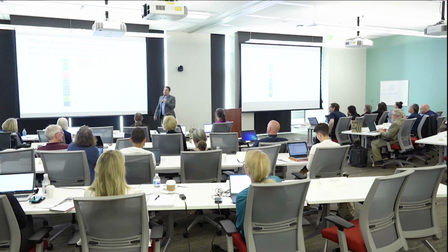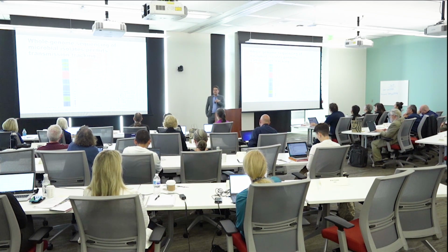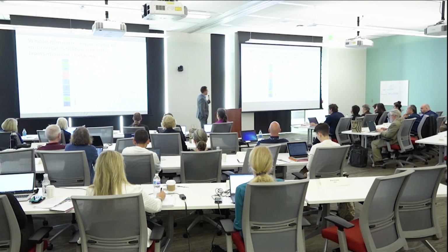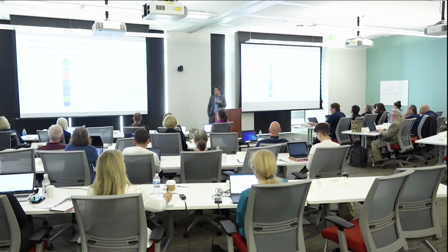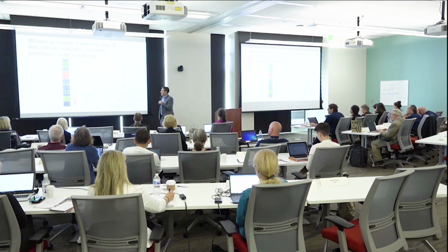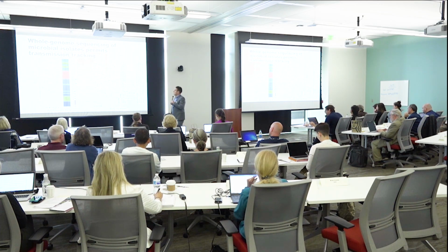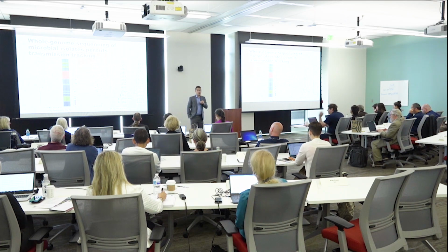Okay, so serious stuff now, slightly more serious stuff. I want to try and sell to you, I guess what I'm selling today is the idea of source attribution and epidemiology and strain tracking. And I'm going to give you two hopefully quick case studies. And of course, it relates somewhat to what Julie already beautifully presented. But hopefully it will strengthen that idea that genomic epidemiology is a really important tool.